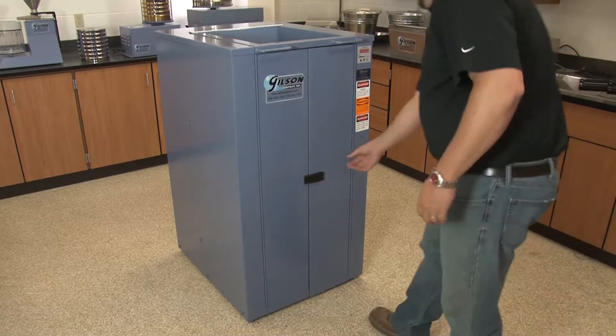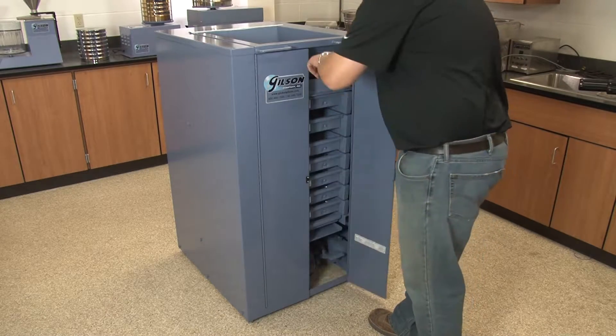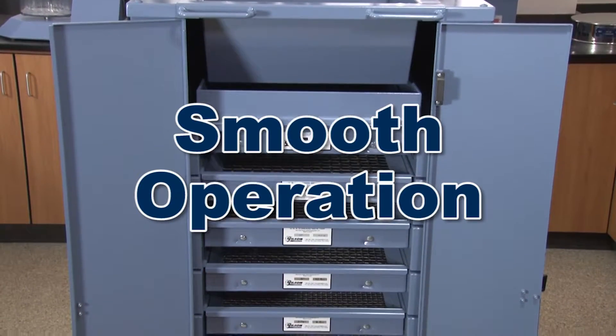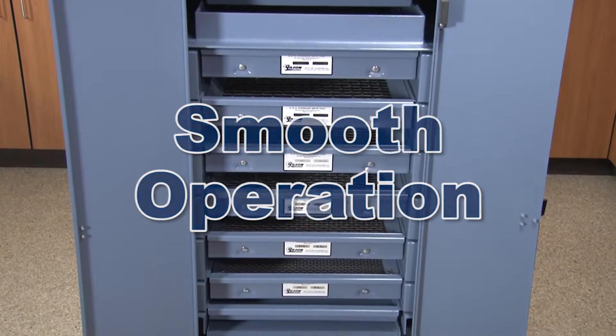Fully enclosed Gilson TM5 and TM6 Testmasters are uniquely designed to be placed anywhere within the lab because of their dependable counterbalance drive assembly.